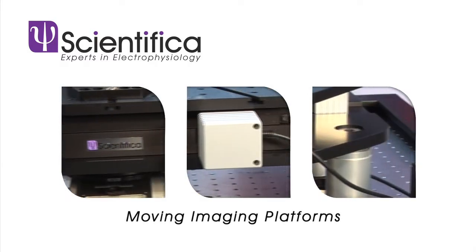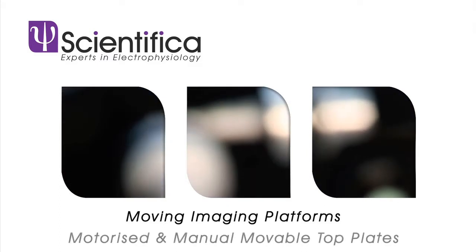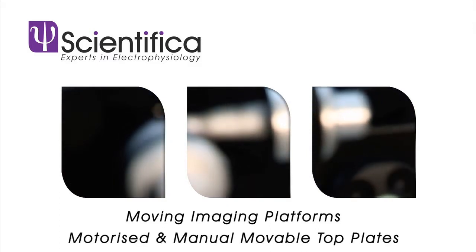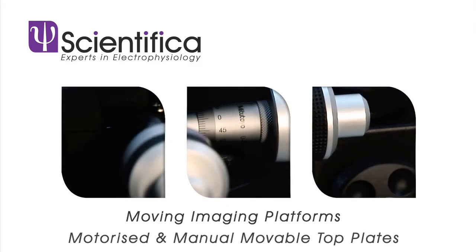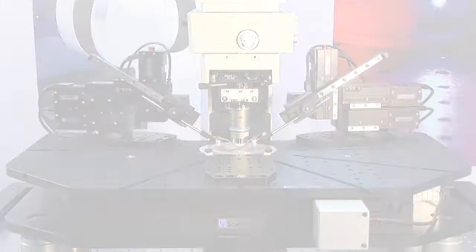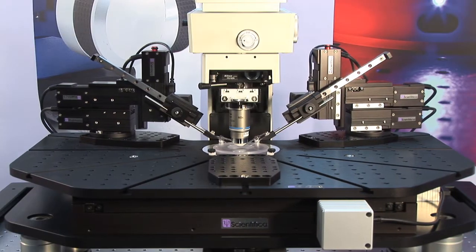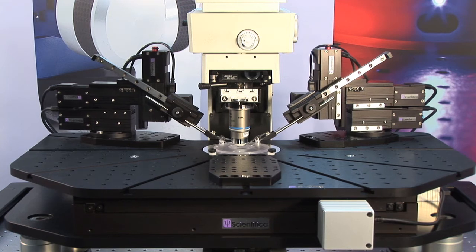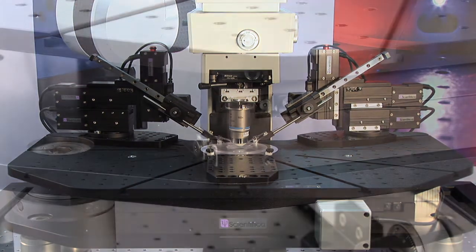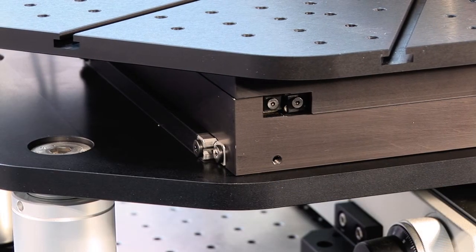The Scientifica motorized and manual top plates offer an ideal solution for combining electrophysiology with confocal and multi-photon imaging. The motorized moveable top plate utilizes cross roller bearings to achieve super smooth movement from the middle right to the edges of the travel regardless of the load on the plate.